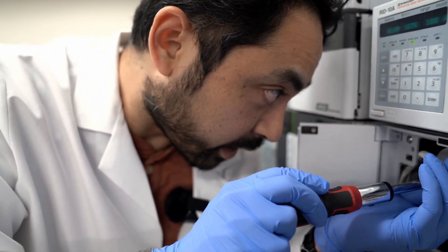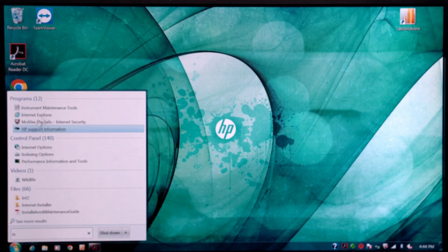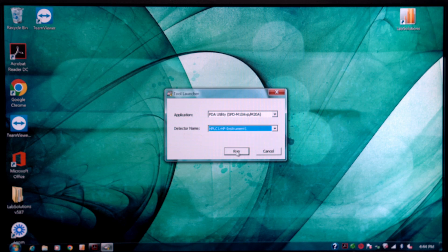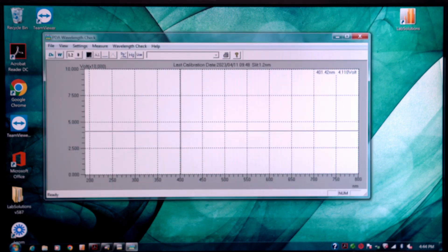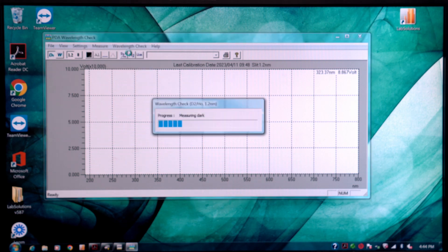You have to do the software calibration to make sure everything passes. The first thing you want to do is go to Instrument Maintenance Tools right here, and then we want to select M20A and HPLC1. And the first thing you want to do is a wavelength check, so you click that and you go wavelength check and then D2 Hg.